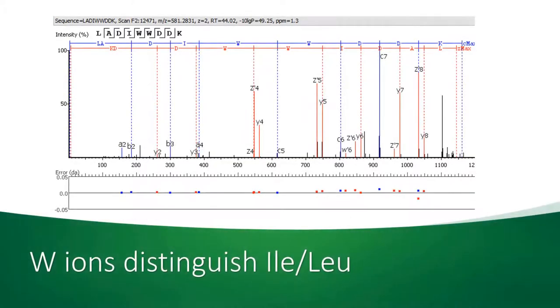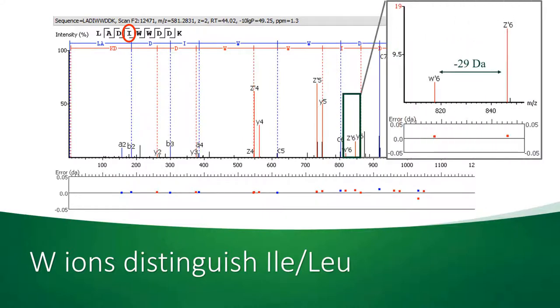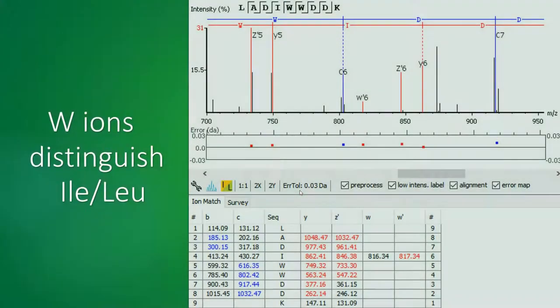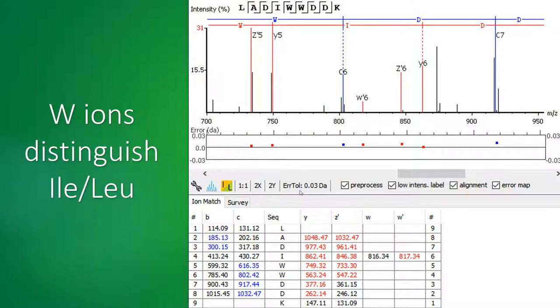Whereas isoleucine loses a 29-dalton ethyl group. For example, in this peptide, Z6 ions start with isoleucine because there is a peak that is 29 daltons smaller than the Z6 ion peak. In the software, we added ILW ion columns in the ion match table, and red color means that there are peaks matched to the theoretical m/z values.